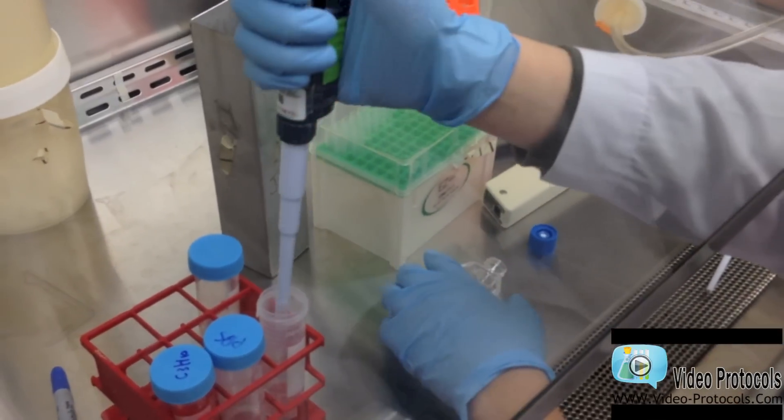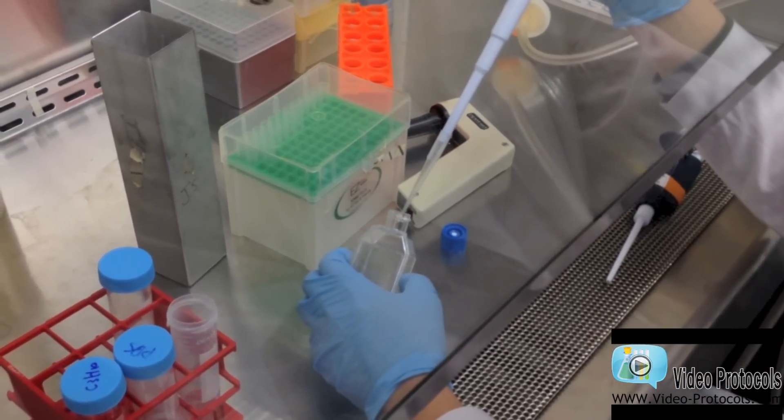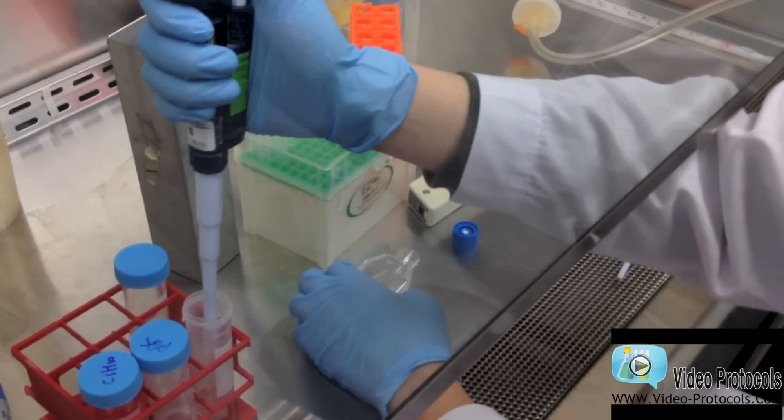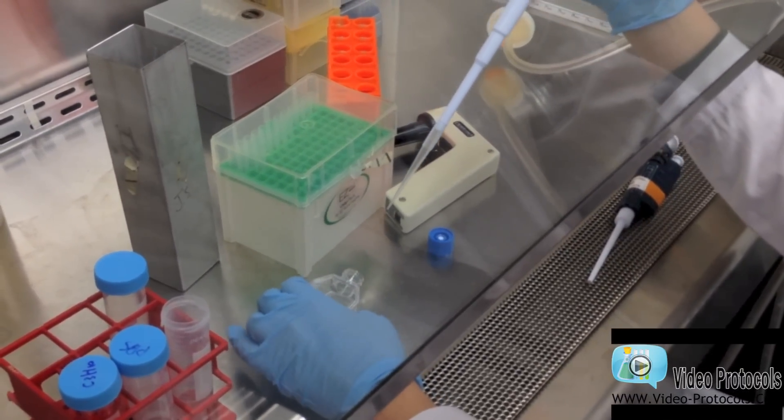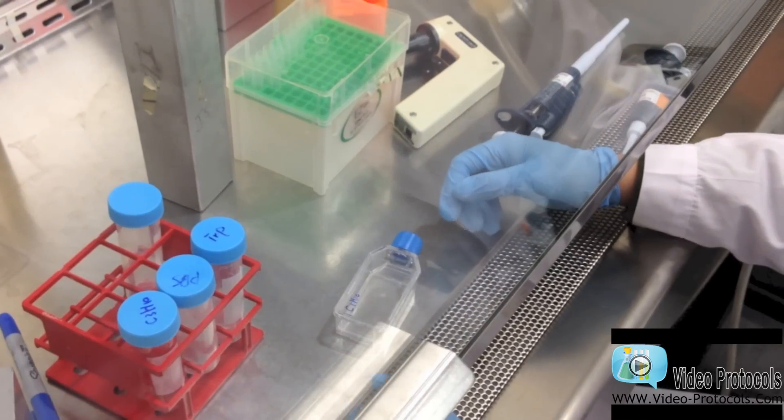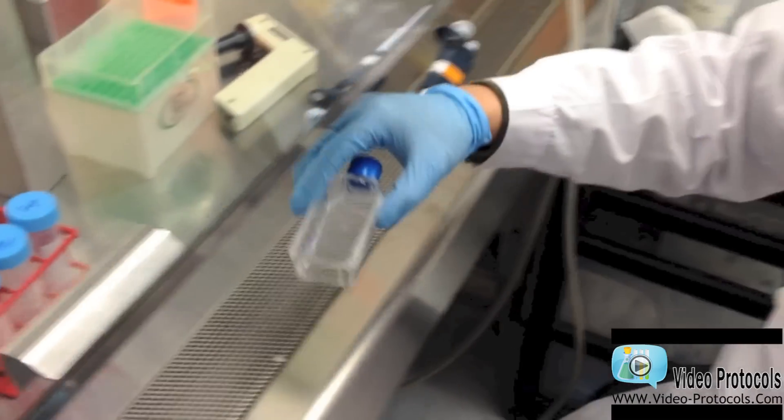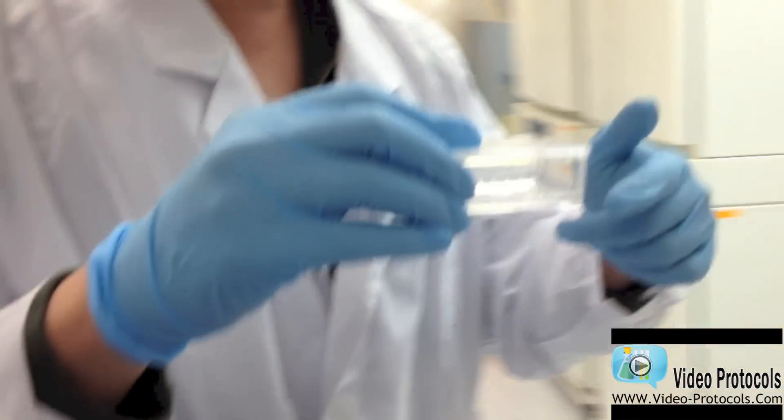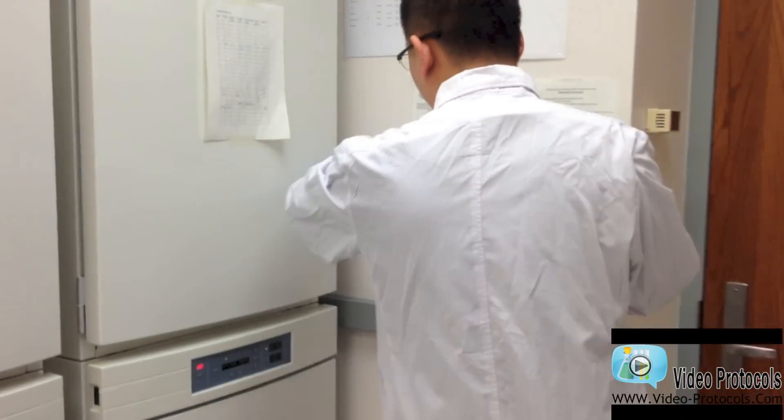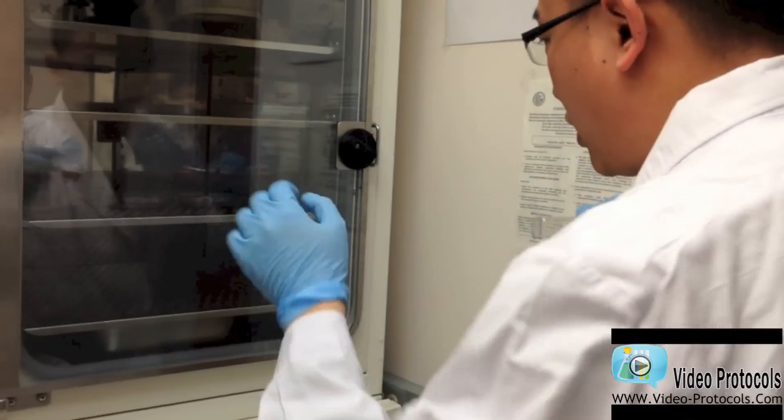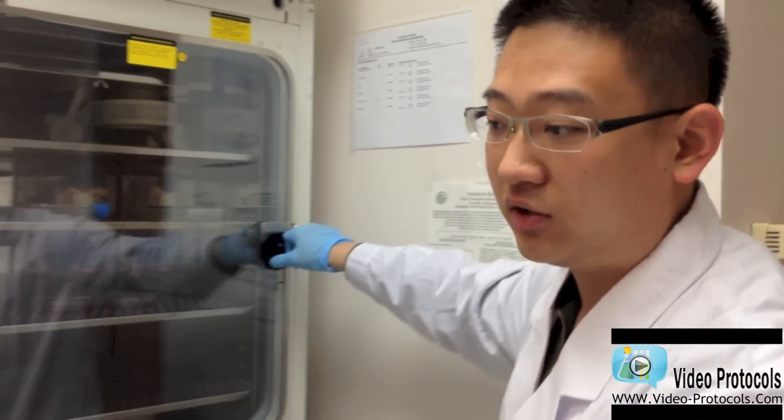I will then use trypsin, an enzyme, to detach the cells from the culture plate. The best working temperature for the enzyme is at 37 degrees. So I am going to put this flask into the incubator and wait for anywhere between 2 to 10 minutes, depending on the trypsin concentration you use and the cell type.